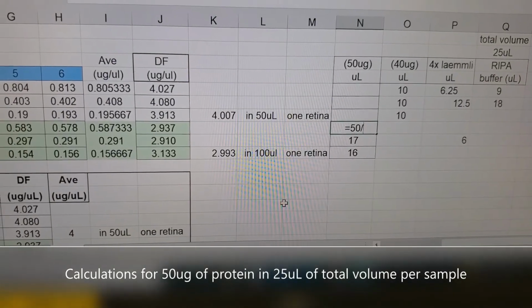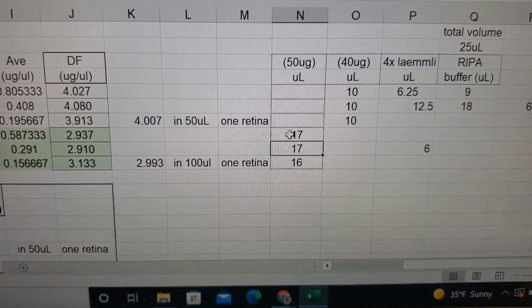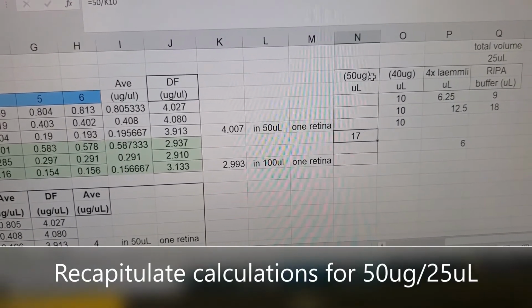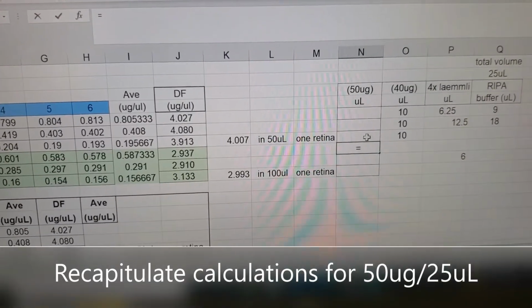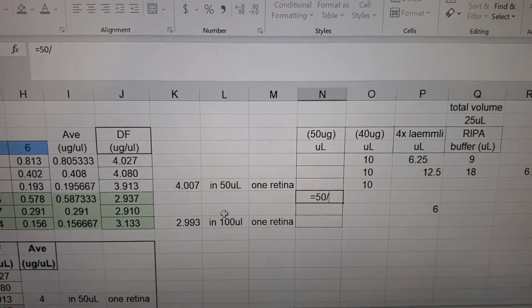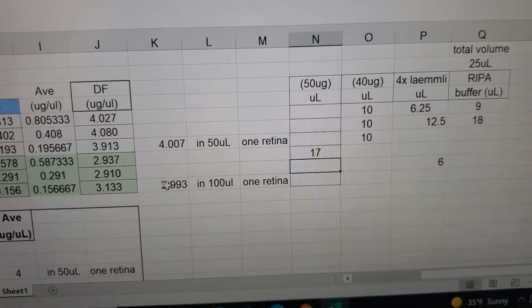So in this case, my concentration is 2.9, that's the average. And so it gives me a total volume of 17 microliters. In order to get the volume of sample that I need to have a total protein of 50 micrograms, I put 50 divided by my sample concentration, which is 2.99, and that gives me 17 microliters.